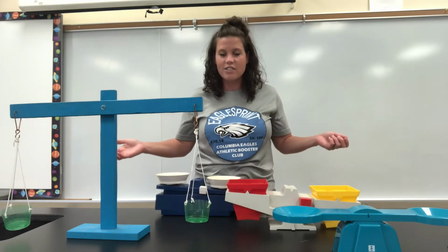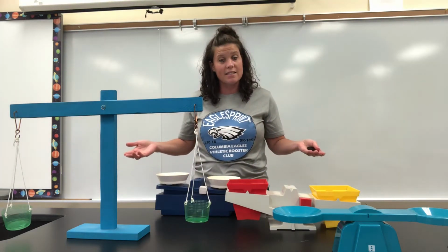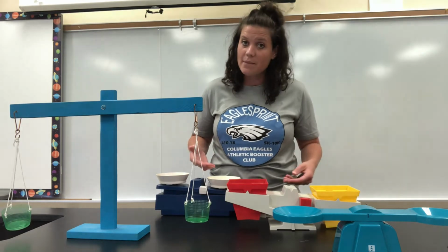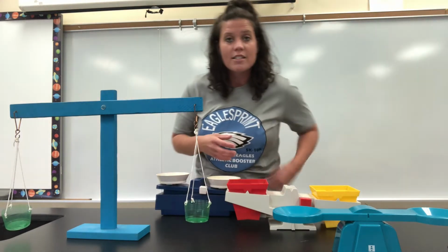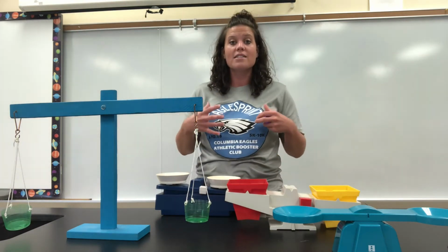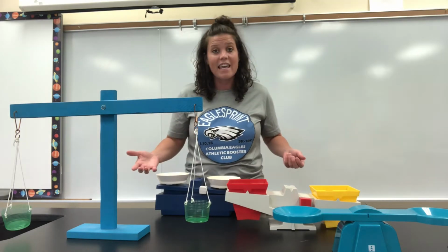As you see here, these are all tools we can use to find the mass of an object. What is mass? Mass is the amount of matter in an object or in a substance. So mass is the amount of stuff inside. Sometimes we use the term weight to describe mass, okay? Mass is a measure of how much stuff is inside something, so we can weigh it.